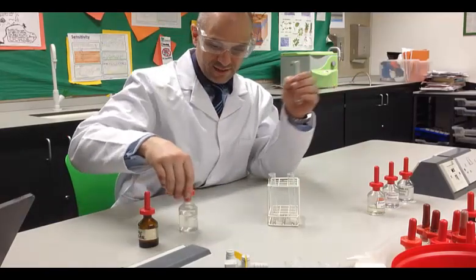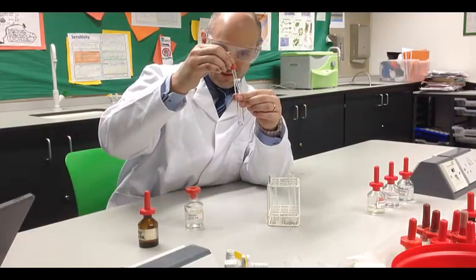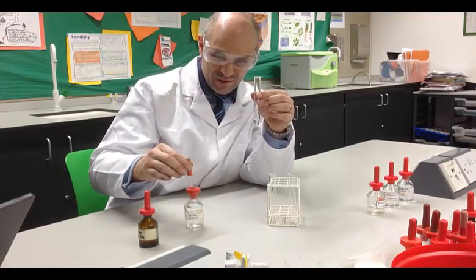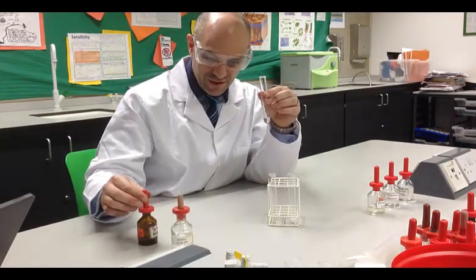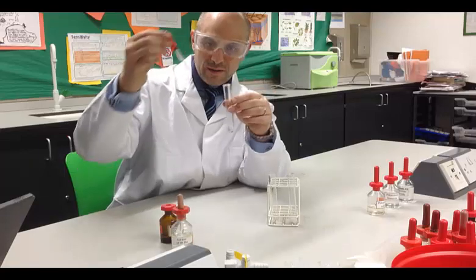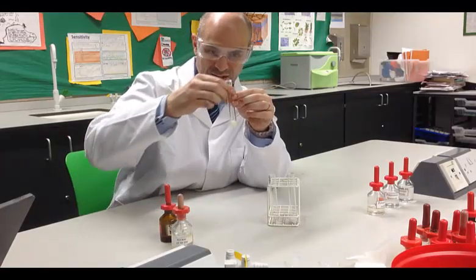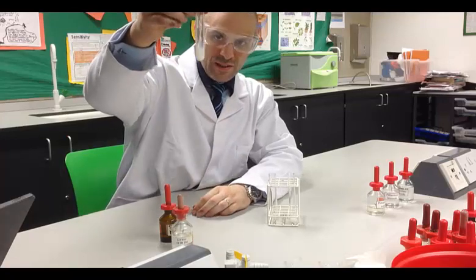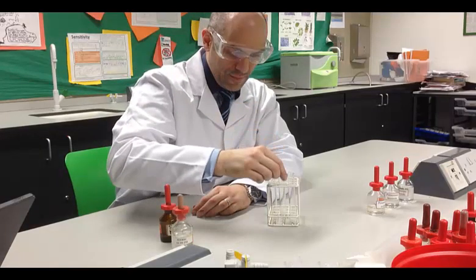Then I'm going to add some nitric acid in order to remove any solid. Okay, there is none there, but just for completeness. Then we're going to add the test reagent, silver nitrate. Okay, notice now that we have another white precipitate, but it's more off-white or cream in colour.